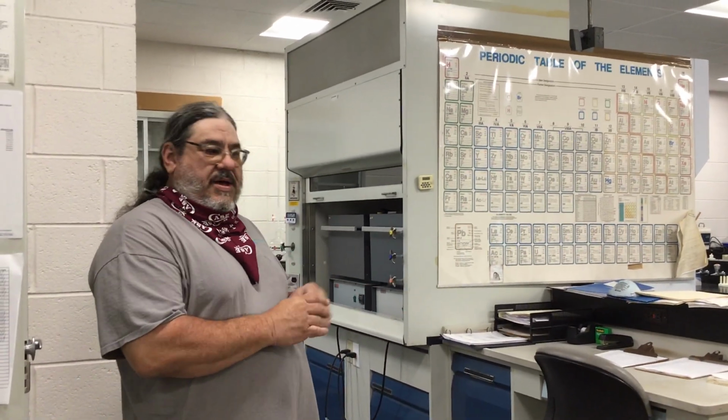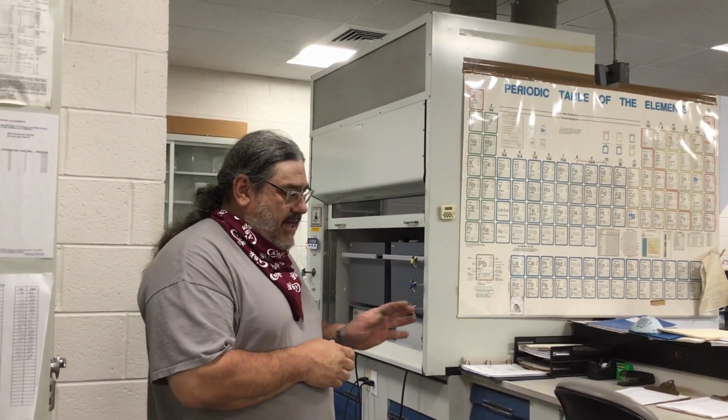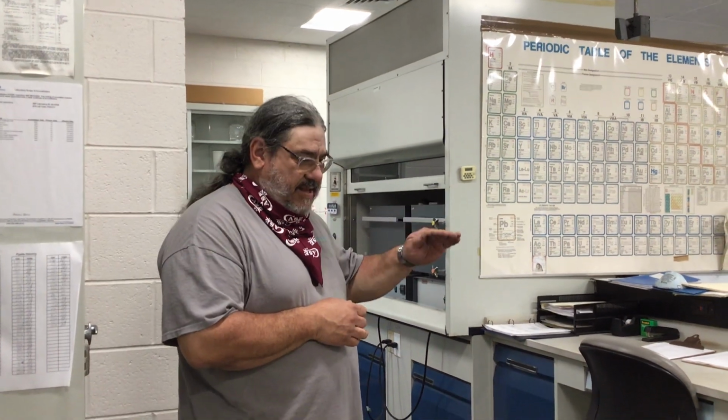Process control, we have to do various tests to make sure that the treatment process that we just looked at is functioning correctly. So a lot of that work is solids. Make sure we have the right amount of solids, we're in the correct balance and all. So we do a lot of solids testing for process control. I mentioned how important sludge settleability is. We do sludge settleability testing to make sure that that sludge blanket settles properly.